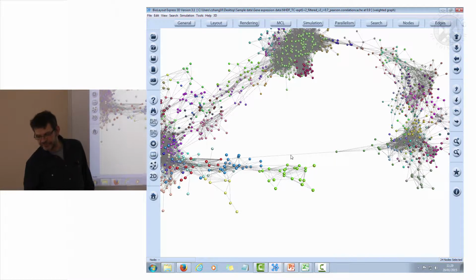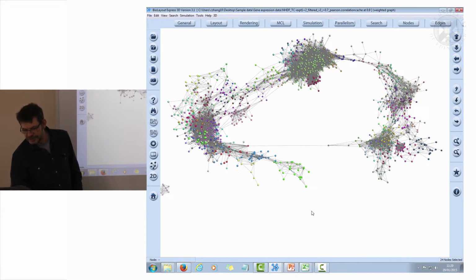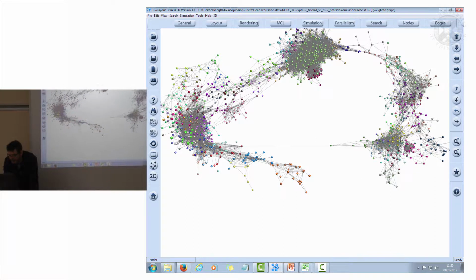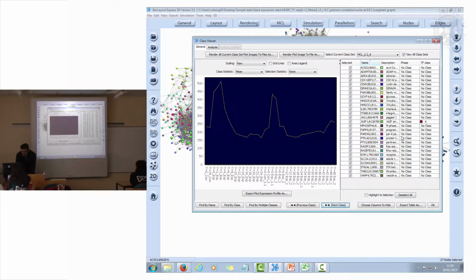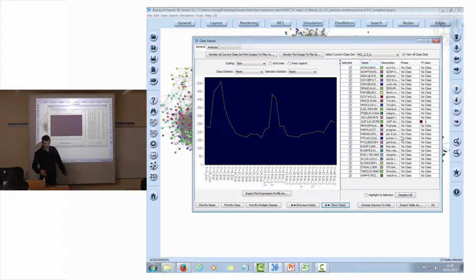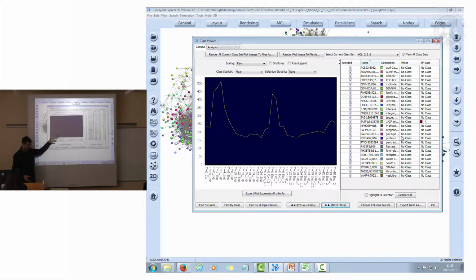So let's have a look at this graph in an overall context, because it allows you to understand what you've got here. We have all of these genes here. If we select some of these guys here, these genes are higher in the unstimulated cells. At 0 hour, their expression level is highest. These are things which are upregulated as cells go into quiescence. These are, if you like, your G0 proteins. These are things that keep cells from dividing. You'll find a lot of tumor suppressor genes within this collection of genes.